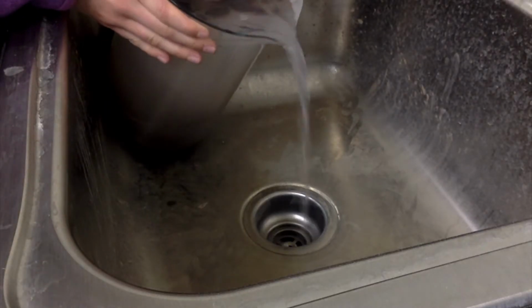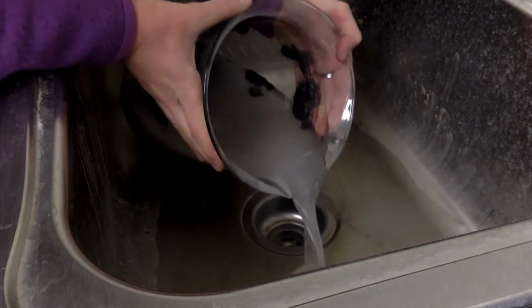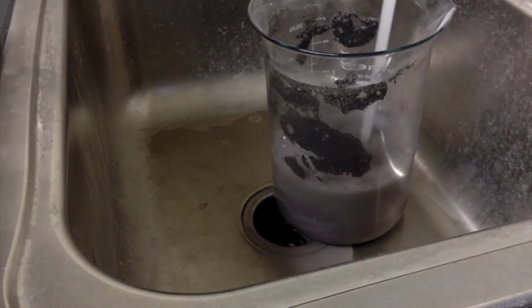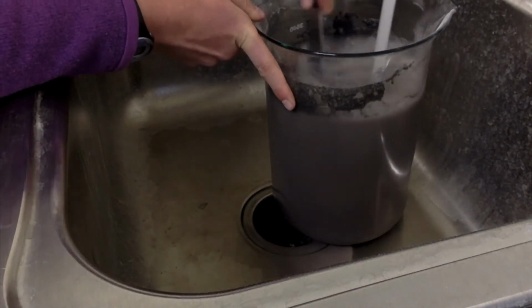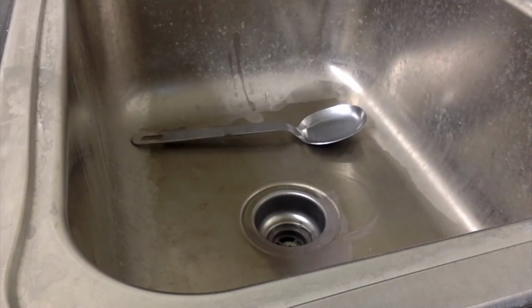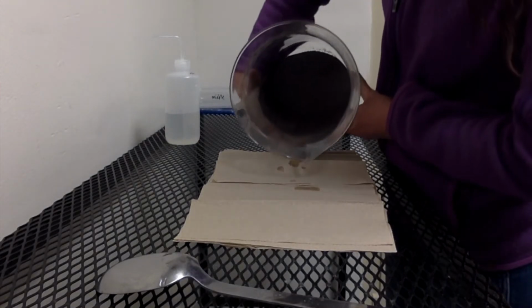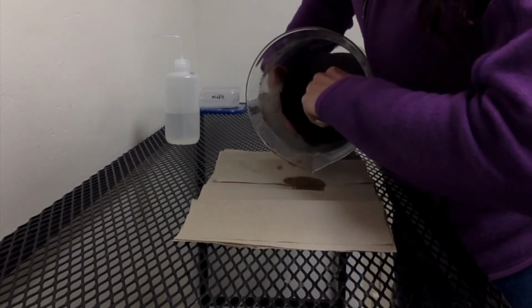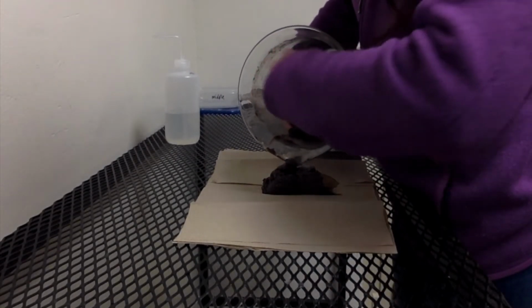I decant by pouring off the water and the tiniest particles off the top. Then I refill the beaker with water, stir it up, and allow the beaker to rest for 20 minutes. I'll repeat this process until I am down to 1 minute. After the 1 minute round and decanting all the water, I will put the sample on a paper towel to dry overnight.